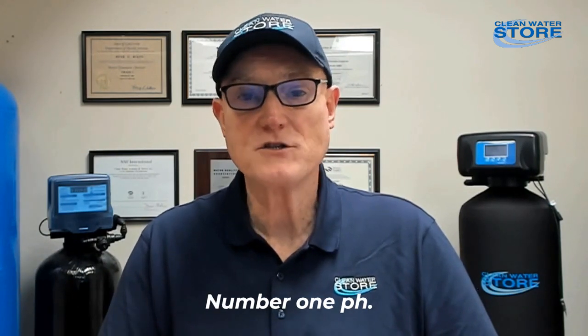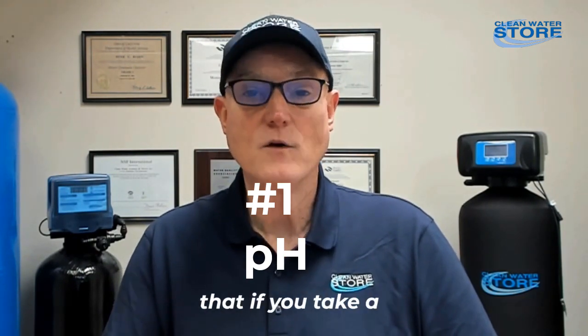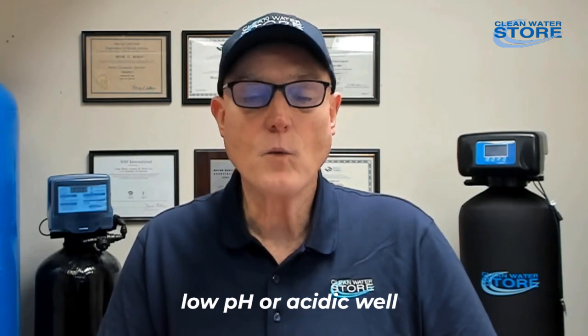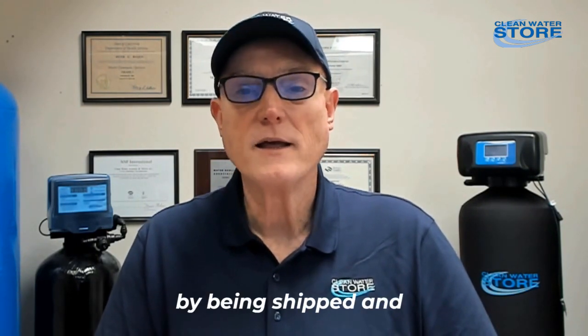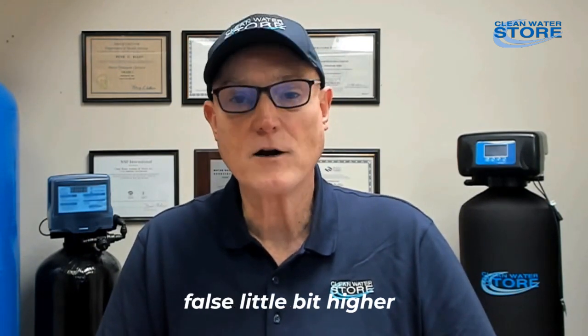Number one: pH. There are a lot of reasons to test pH yourself at home. The first is that if you take a sample of water and send it into a lab, there's a good chance the pH will go up a little bit. It can change because low pH in acidic well water is often a result of dissolved carbon dioxide in the water.